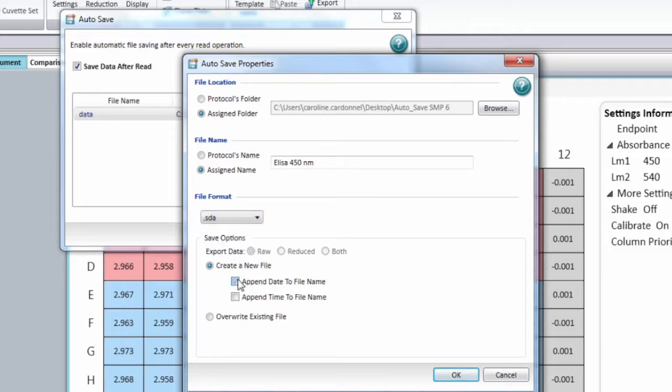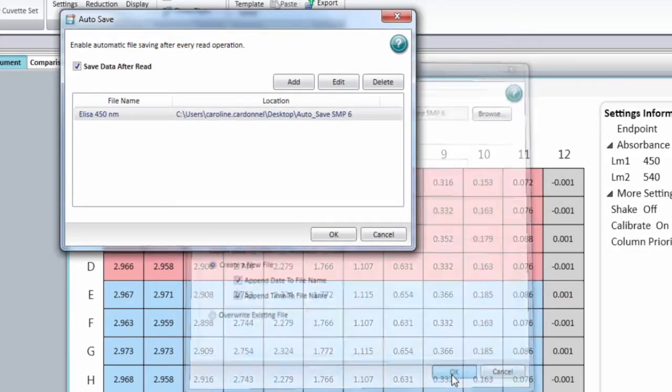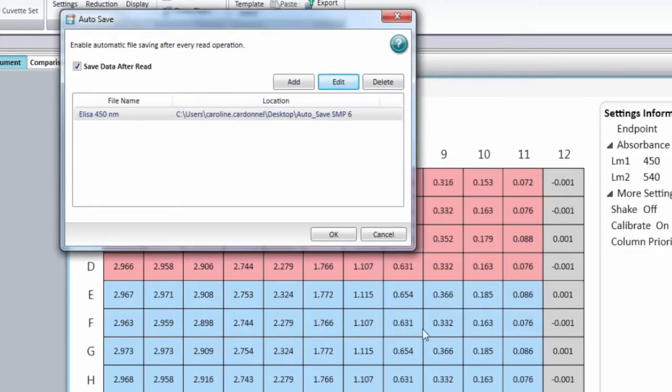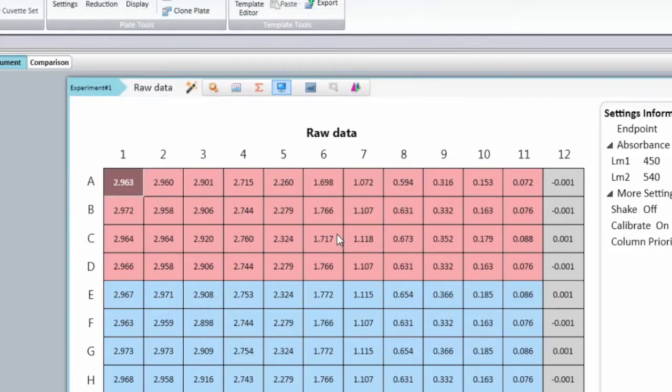Then select append date and append time, and click OK. You have now a new autosave that has been enabled.